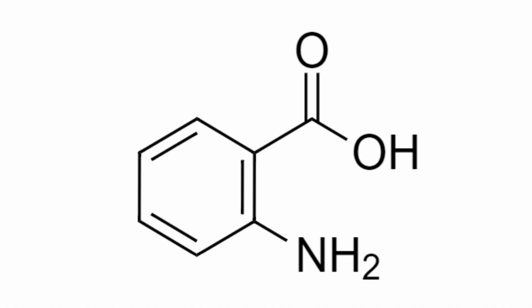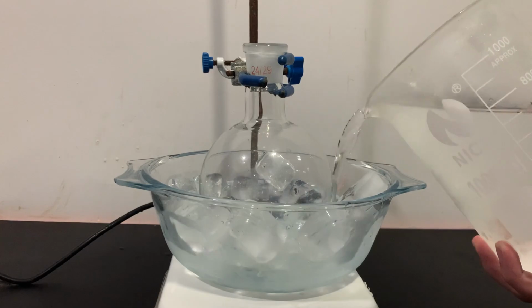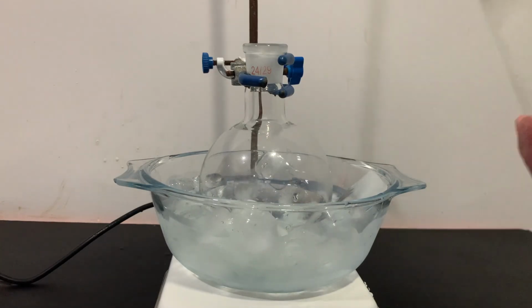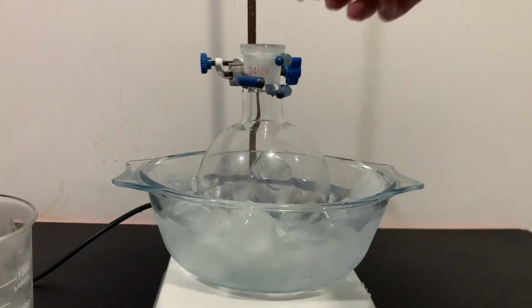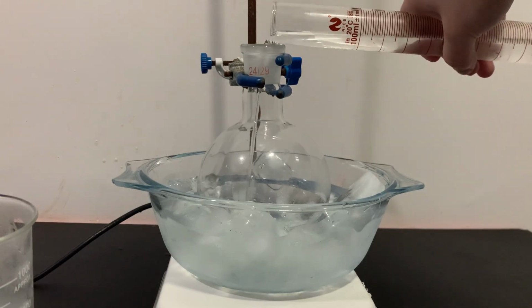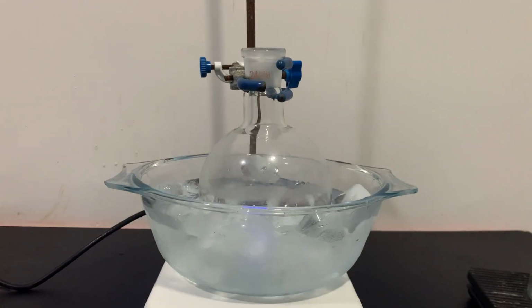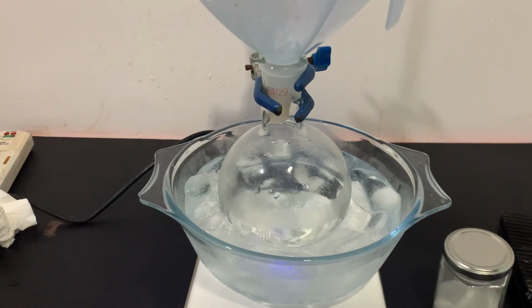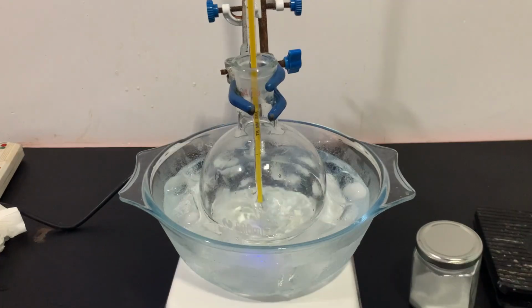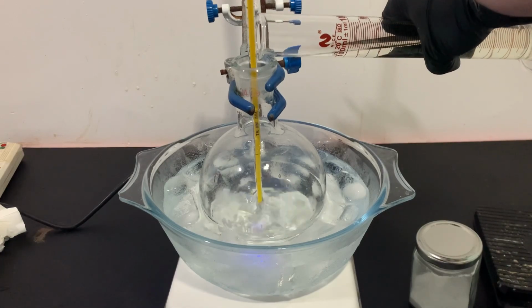Now that I had phthalimide, I began making the anthranilic acid. I firstly got a flask and cooled it with an ice bath. I placed in a stir bar and poured in 60 milliliters of water. I turned on the stirring and slowly started adding 15 grams of sodium hydroxide in small portions. I then slowly poured in 65 milliliters of bleach, making sure that the temperature stays low.